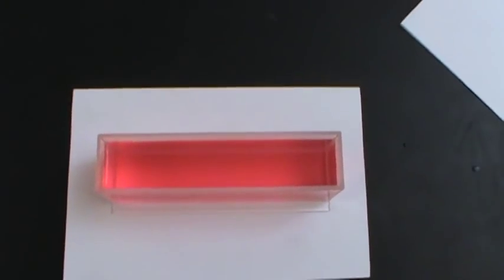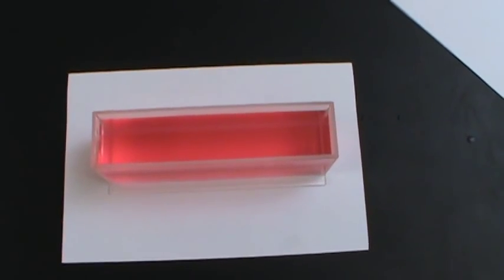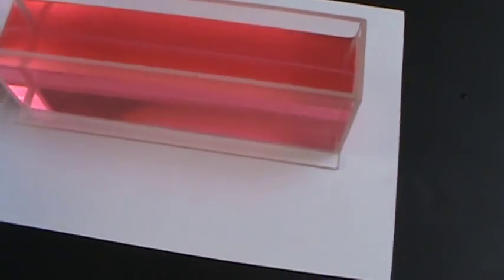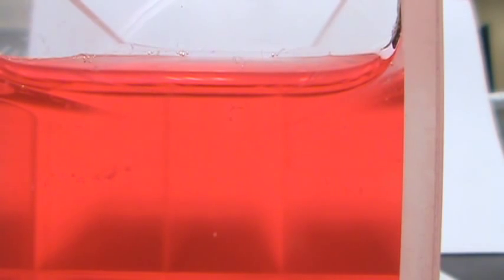Most people have at some point or another looked through some really thick water in a lake, in an ocean, in a video, and the thicker the water, the more color you see in the water. So let's just take a look here. If I come around to this edge, so I'm looking through the long direction now. I've got a piece of white paper back there just for some visual reference. There is the red that we're seeing in that direction.